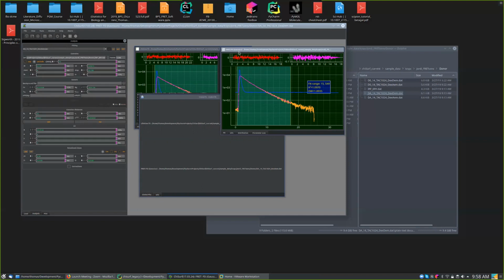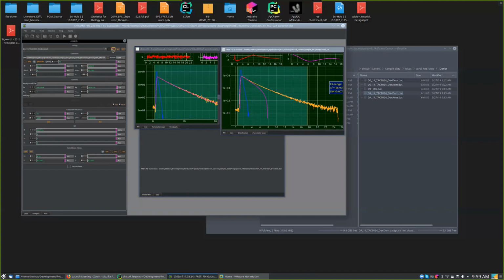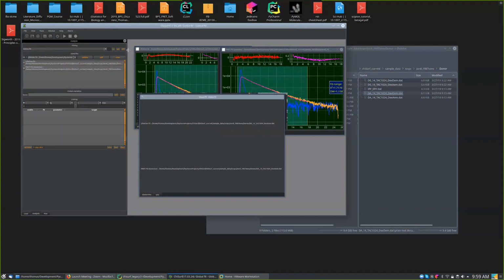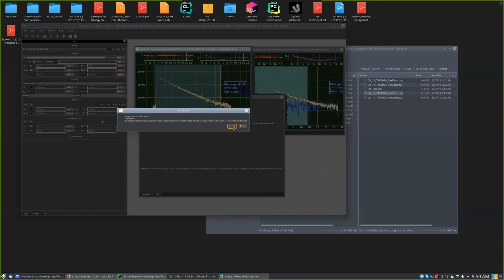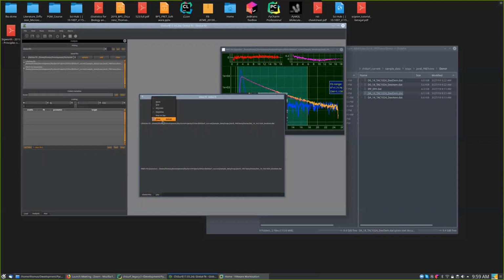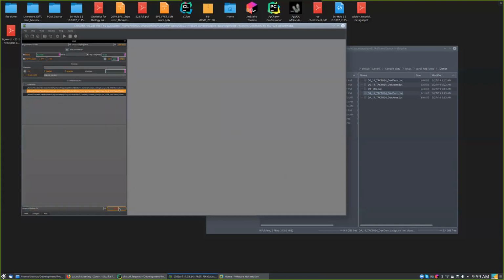Okay, now the fit ran away. I would say the most general is still, I close now the data sets and we start over, just very fast. Because if you find that something strange is happening, it's better to just start over again.